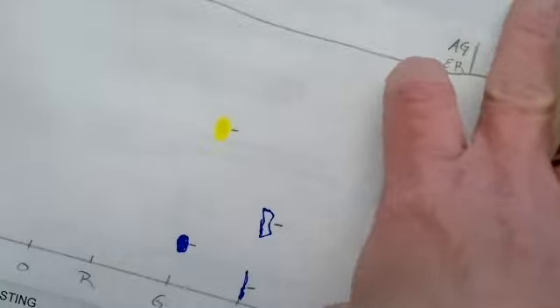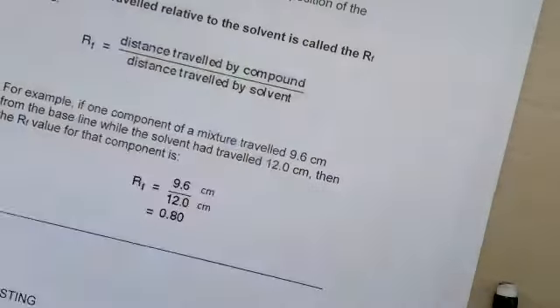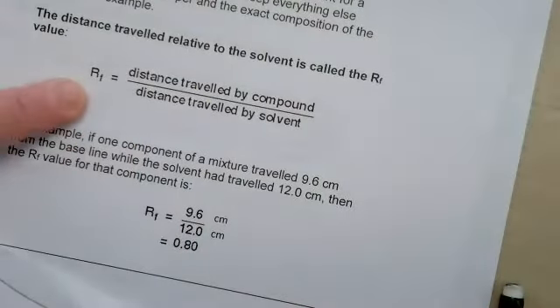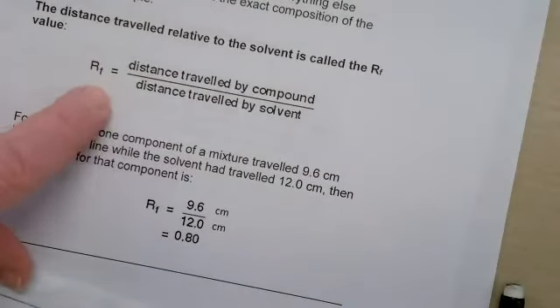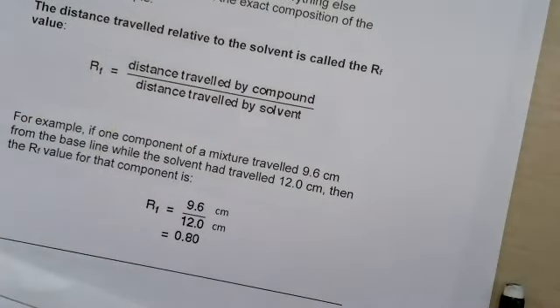We're going to have different distances of solvent travel. But how do we know if the green on my M&Ms did the exact same thing as Abby's group or Aaron's group or Mary's group? Well, that's where what we call the RF factor comes in. There are rulers at all of our stations. We are going to measure what we need here. You don't have to, but I'm going to show you, in the procedure packet and our data table.